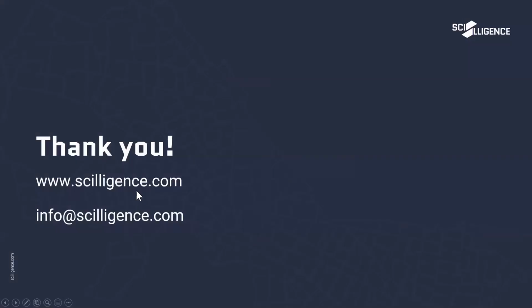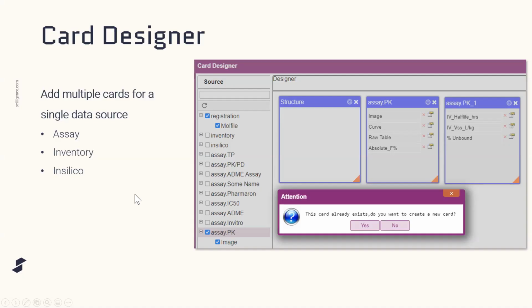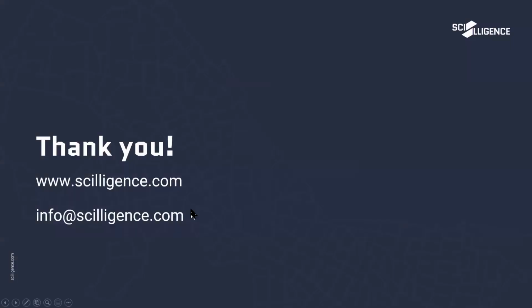I think that's it. So in a nutshell, this is the card designer that was implemented. I think it was worked on the beginning of December of last year, and a lot of effort has gone into bringing this up to speed. We still have a long way to go. I think there are many more options that we can add to the card designer, but I really do feel that this is a nice complement to the current assay view that we have for FOCUS. And with that, I'll be happy to take questions.